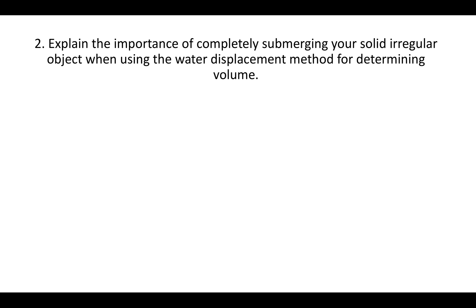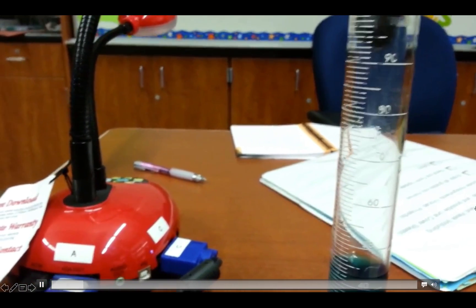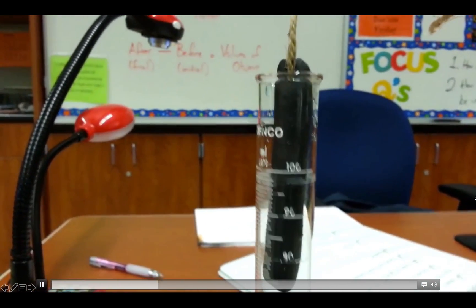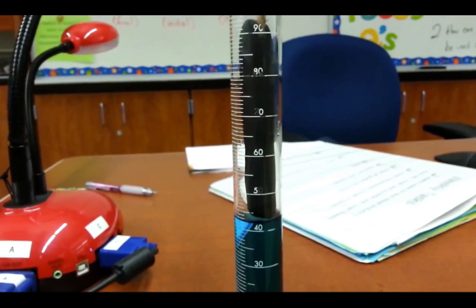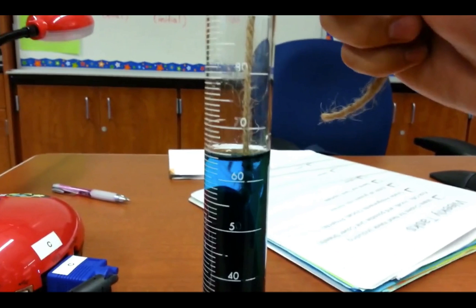If you don't put the full object underneath the water completely, then the water will only go up a part of the object and it won't give you the volume of the full object. To help you see what I mean, here's a video of someone putting an object into the water. You can see how when you continue to submerge the object, the water keeps going up. So if you want the volume of the full object, you have to submerge the whole object.